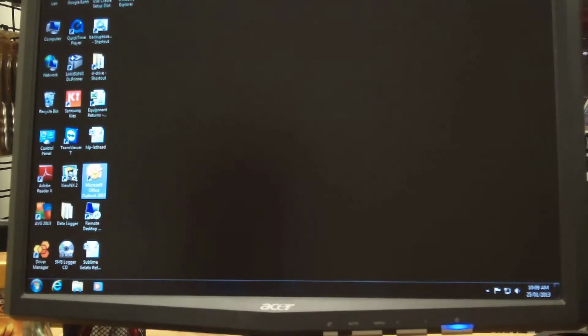This video is to show people how to install the software for the HLP range of data loggers. Now we sell quite a lot of these data loggers. They're very popular in the food industry and also in the pharmaceutical industry, medical, vaccine storage, the whole works. The only issue we ever get with the products is the installing of the software.